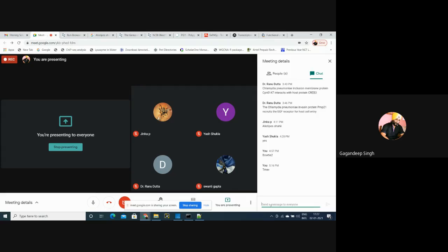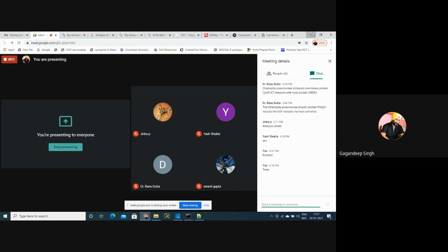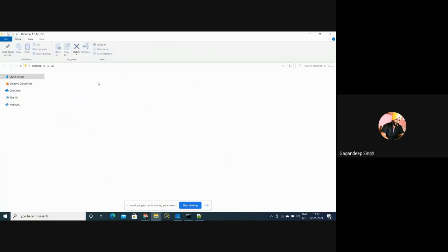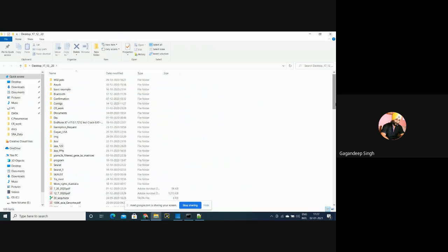I'll show you in one of my presentations how expression analysis will come in the form of some values and how we have to calculate that expression analysis.